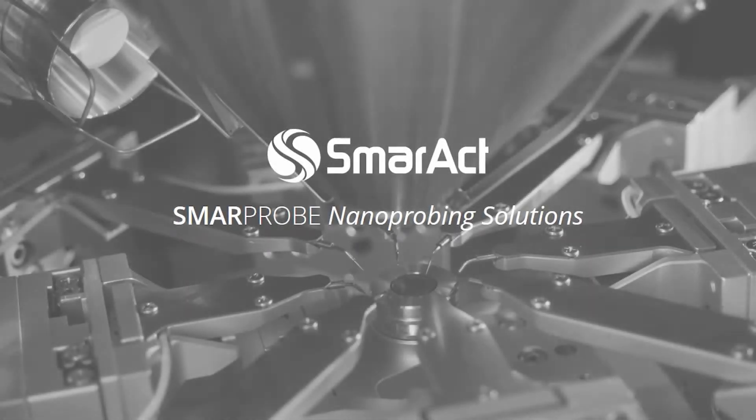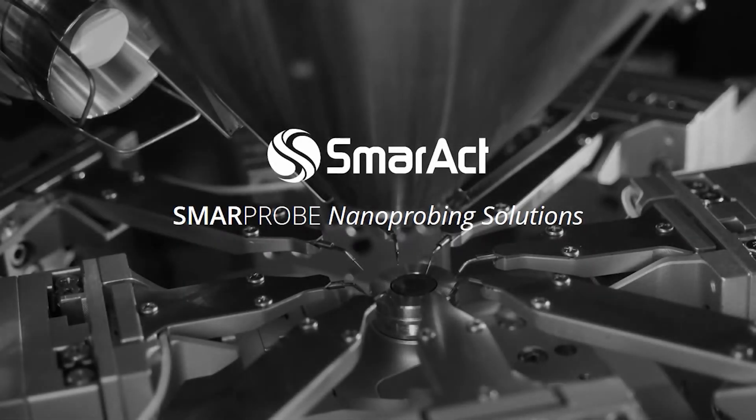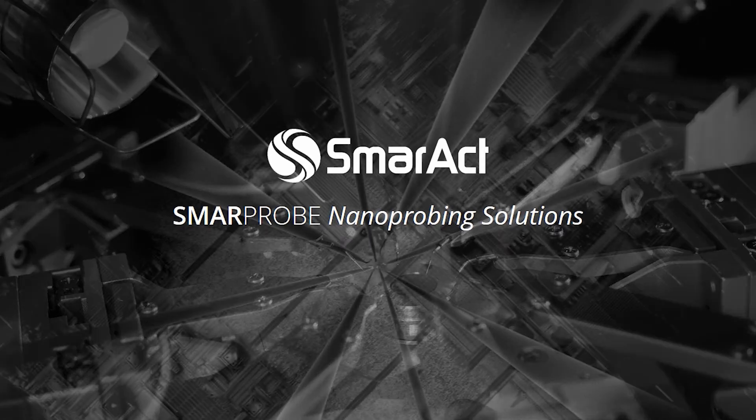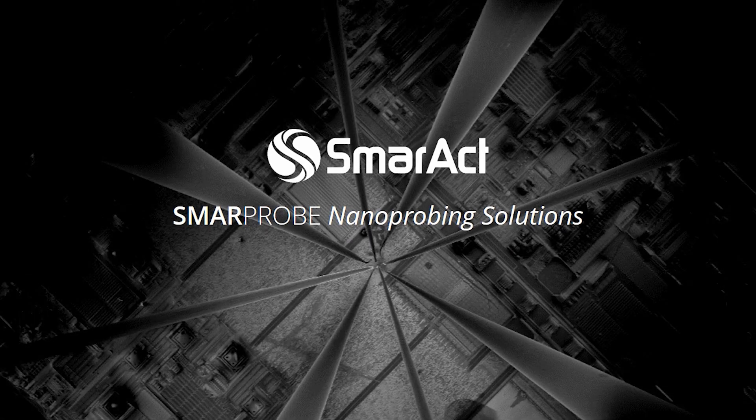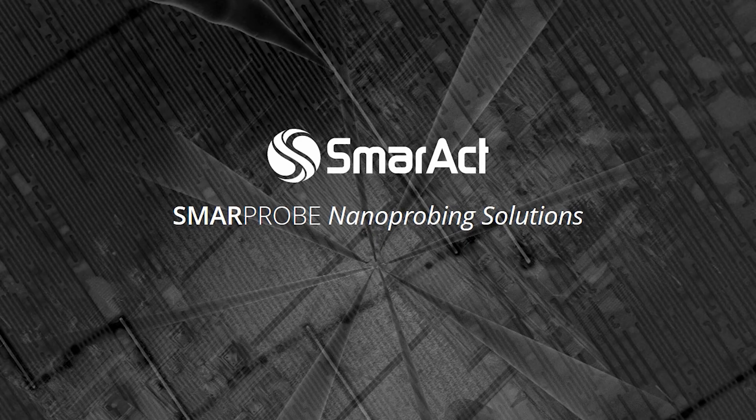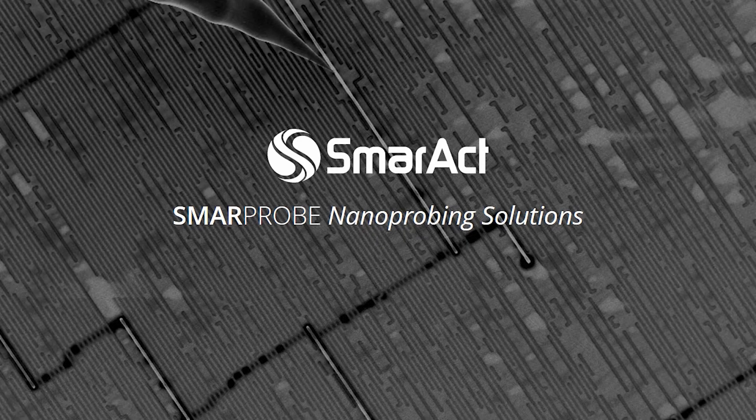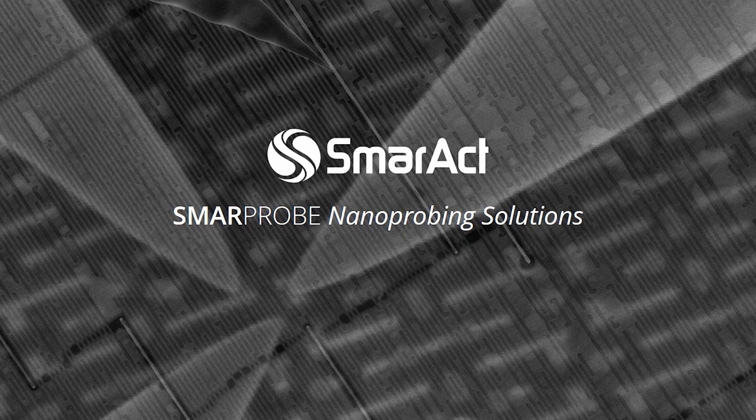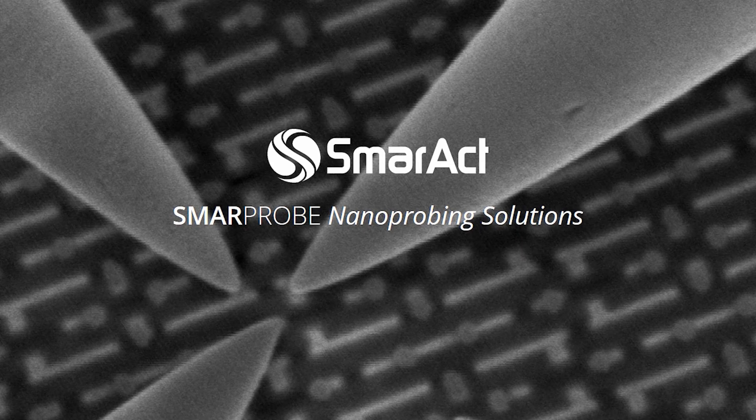SmarProbe is the high-precision platform for nanoprobing tasks. It is based on SmarAct's most advanced motion system and controller generation. This video will present the SmarProbe motion system, software, and accessories.